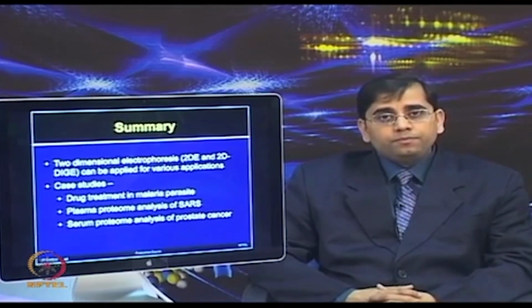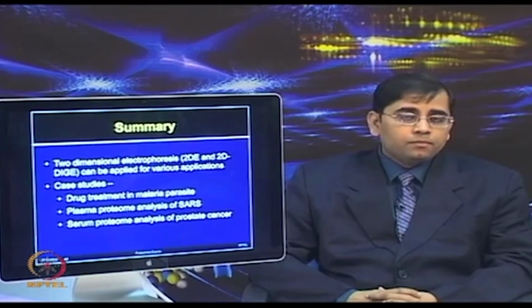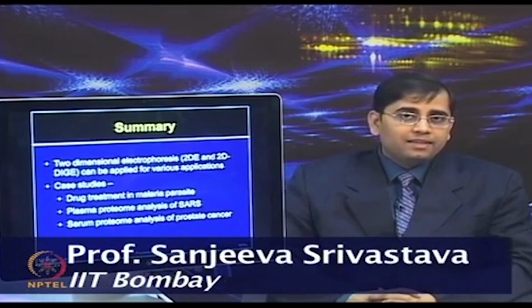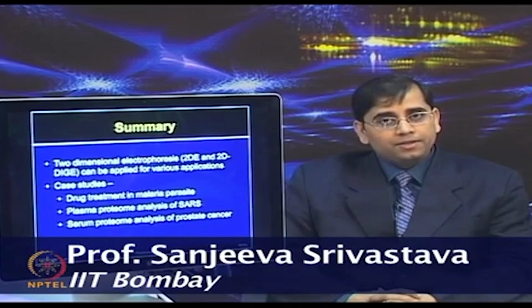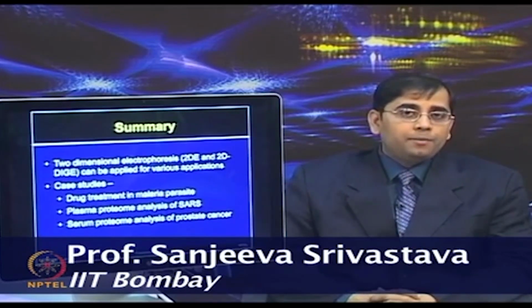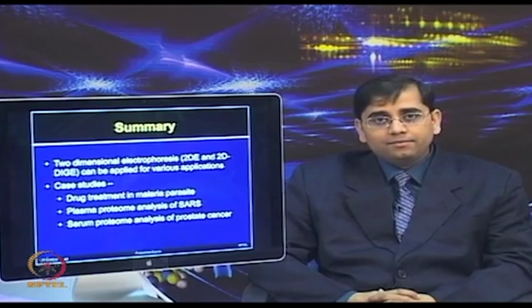But regardless of the pitfalls of each of these techniques, you may appreciate that there is a lot of power in these techniques, and these can be employed for any biological application. You pick an application of your choice, and I am sure you will be able to answer those by employing 2D or 2D DIGE techniques. Thank you.